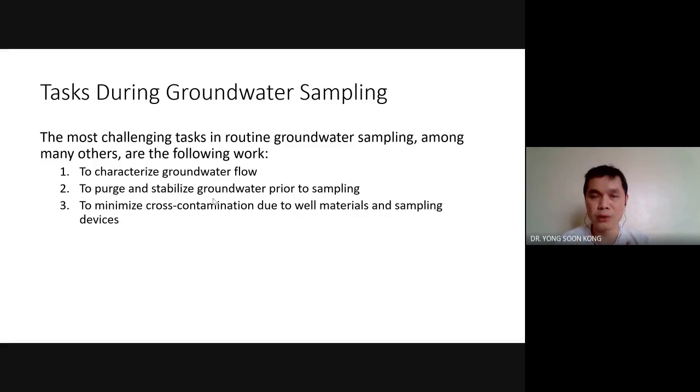Okay, water, groundwater that is trapped inside the tube. Why do we need to remove that? For a very simple reason. Groundwater is saline. It comes in contact with the inside of the steel tube. I think that's very obvious, right? Corrosion may happen. So when corrosion happens, does that trapped groundwater reflect the nature of the groundwater?